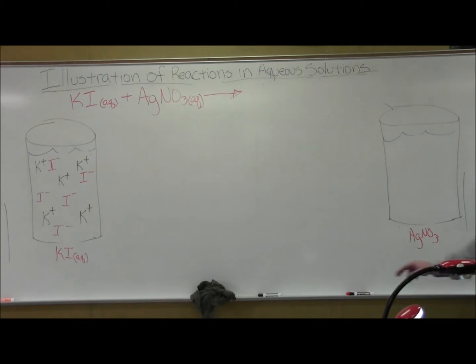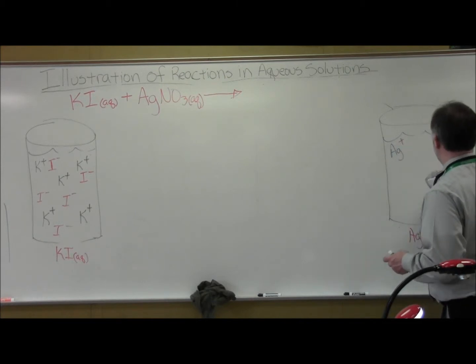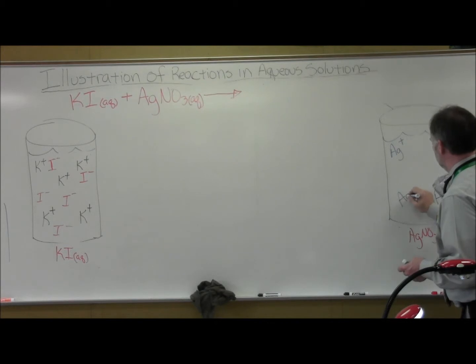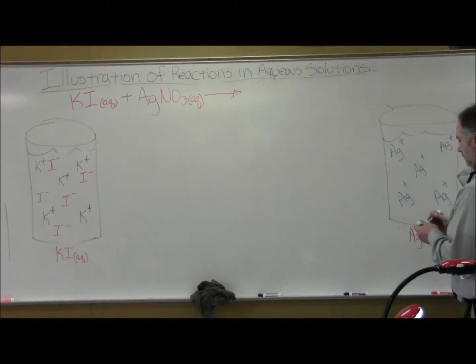And this is aqueous also. So I'm going to have some silver and some nitrate all dissolved. Here's my silver.